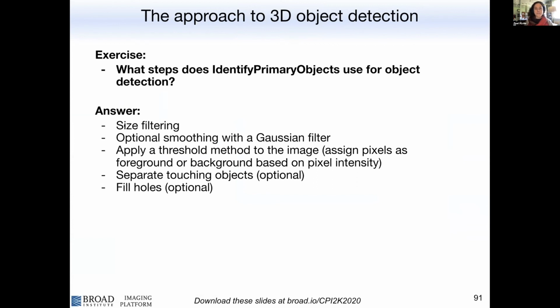You were adapting the size thresholding for how big can a nucleus be, for example. So you were changing the pixel values for that. You were smoothing potentially the image ahead of time with a filter to make it easier to avoid splitting a nucleus into two when it should be considered as one.